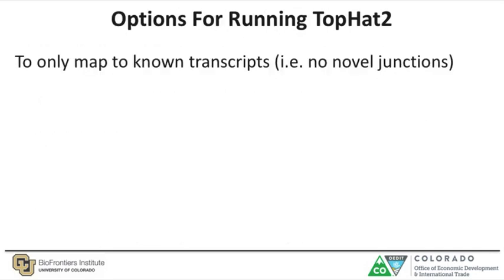Because there are so many options for customizing TopHat, I'm not going to go over every single parameter that can be included in the command line. Instead, I'm only going to focus on one scenario in which you map reads only to known transcripts and skip any de novo or novel splice site discovery.